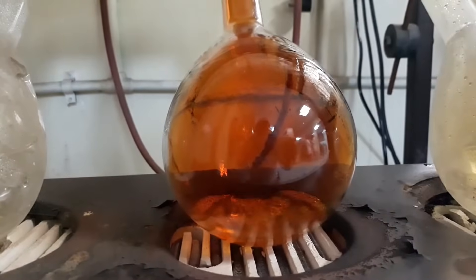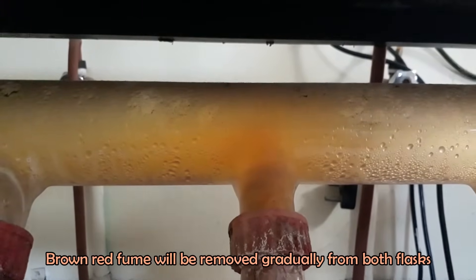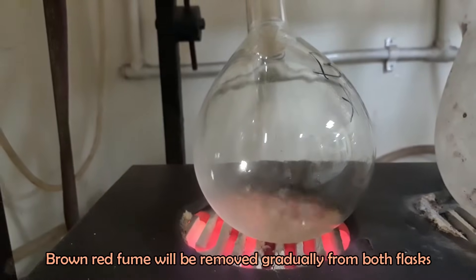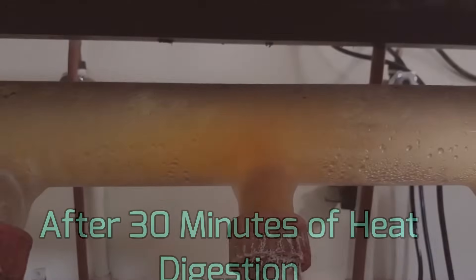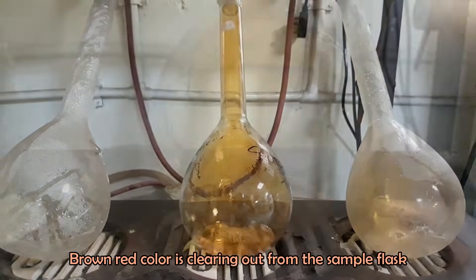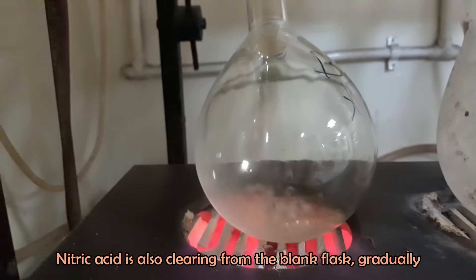Place the flask on a heating mantle and heat at 120 degrees Celsius for heat digestion. Brown-red fumes are formed because of the nitric acid. The brown-red fumes are clearing out over time, which indicates that the nitric acid is being removed from the flask.